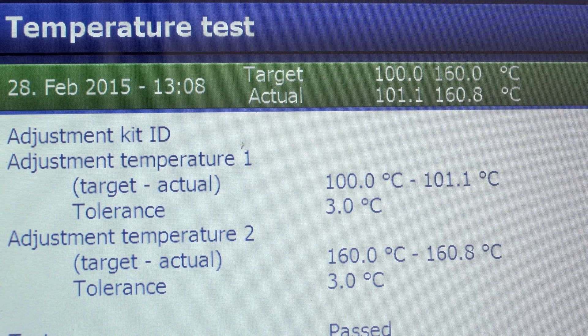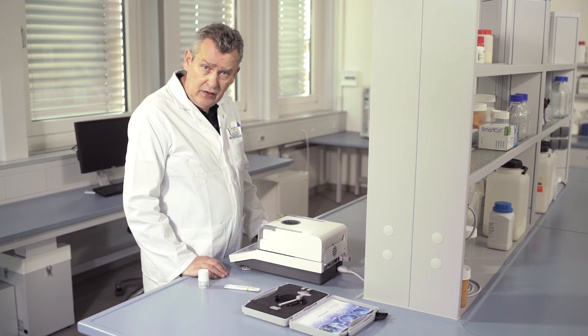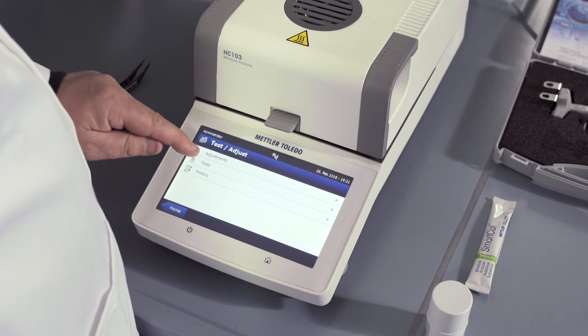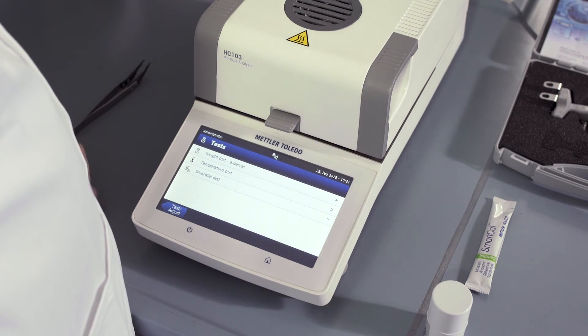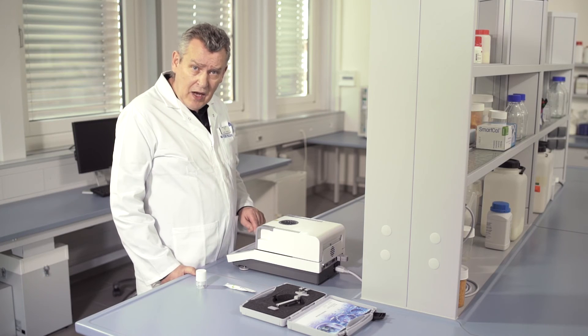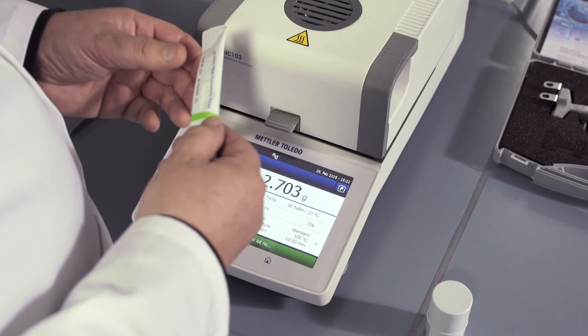To perform an overall instrument test using Smart Cal, select test adjust, then tests, and then press Smart Cal test. Enter the Smart Cal lot number found on the stick.